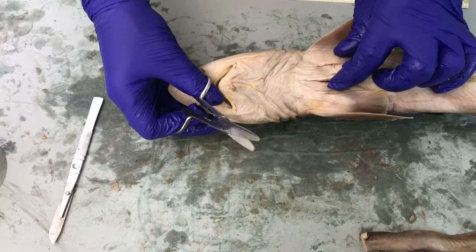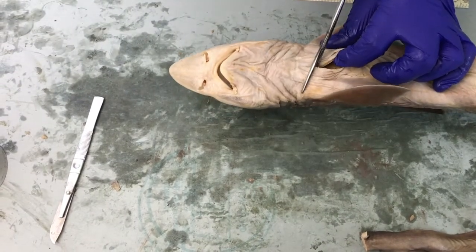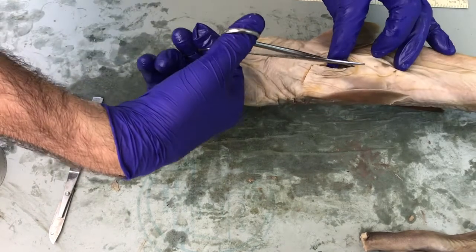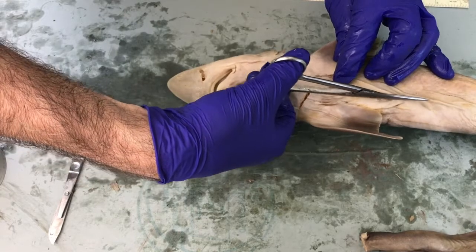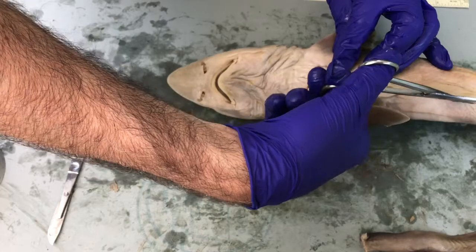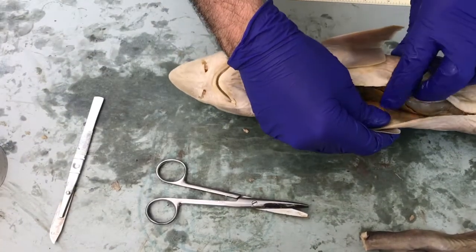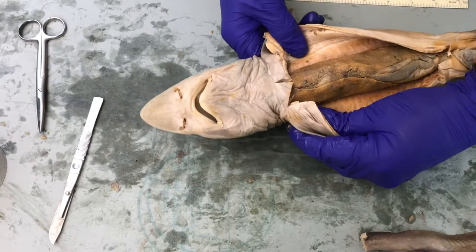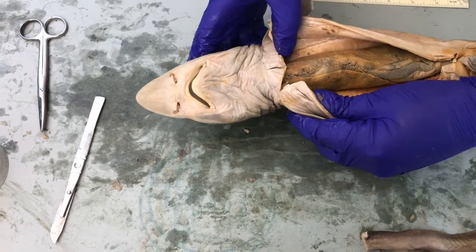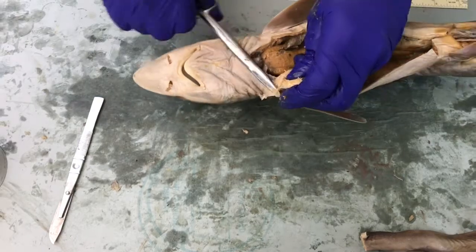And then once I get it going a little bit, I'm going to pull it apart. I might even make a side cut this way right away. That allows this to kind of open up a little bit more. And I'm cutting, making sure, even though these scissors are not pointed, that they aren't pushed too far down into the organs. We don't want to damage those. The main organ you see right away is the liver. And we're going to get into a closer look at these. But let me open this up to spend a little more time.